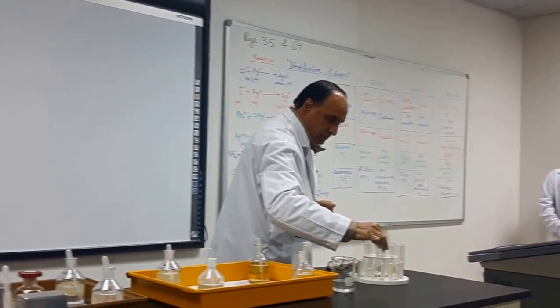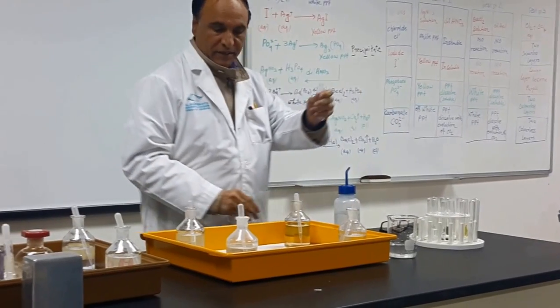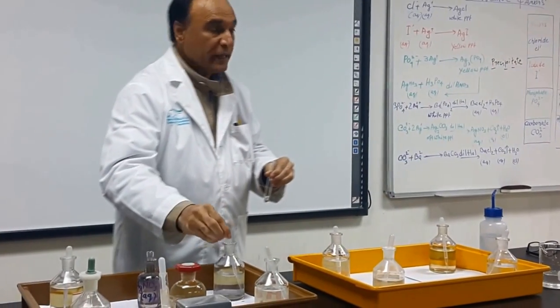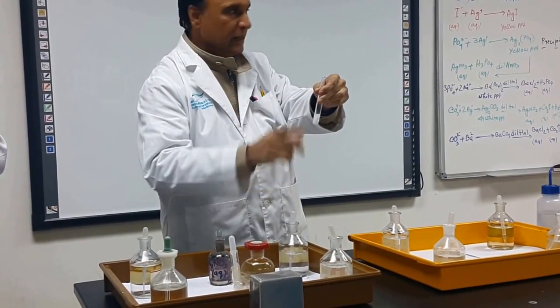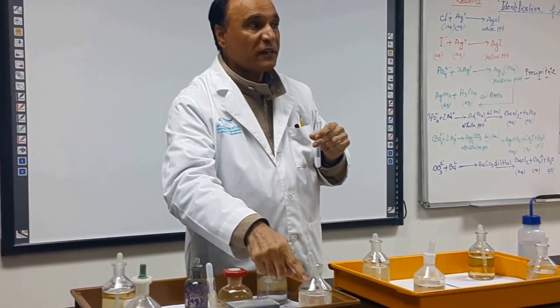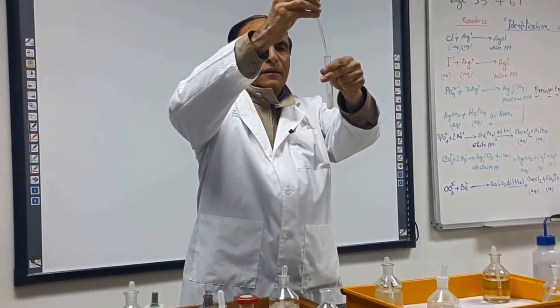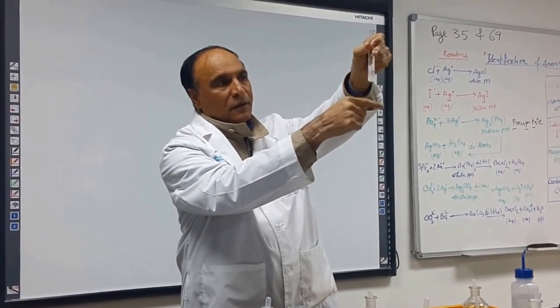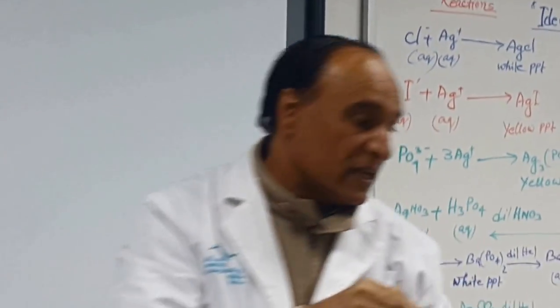Then I do the next test. I take carbonate, then I add into it barium chloride. I add barium chloride from the top, not touching it, and I get a pure white precipitate. Then I add into it dilute HCl to see what? Solubility, and again there will be two observations for the carbonate. Look over here. Gas, and it dissolves. The two observations. The second test is complete.